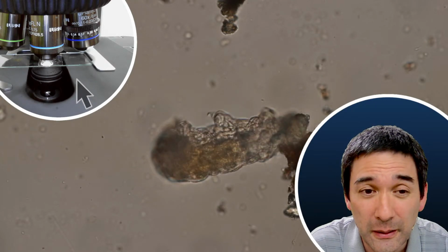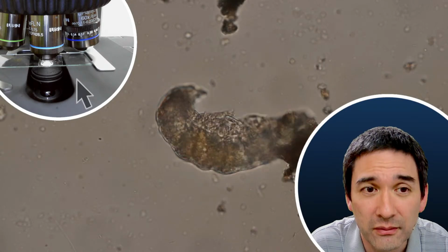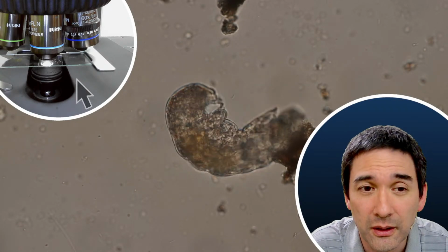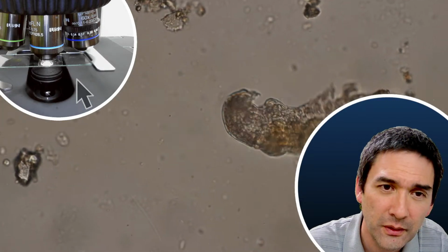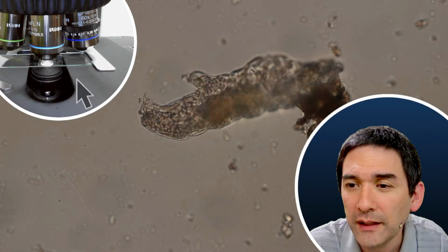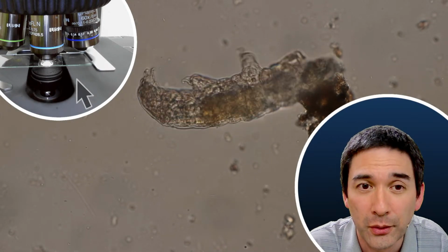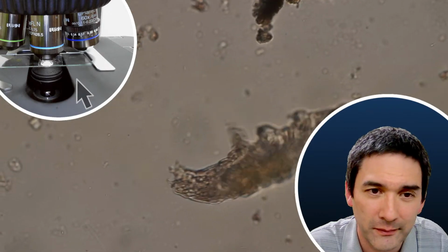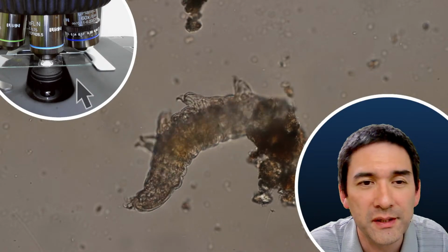Obviously it's got to be reasonably clean. I guess maybe they're also using some kind of compressed air to remove the dust and so on. It gets me nervous when microscopes have to be taken apart. Honestly, I tried it on an old Olympus CHA microscope.